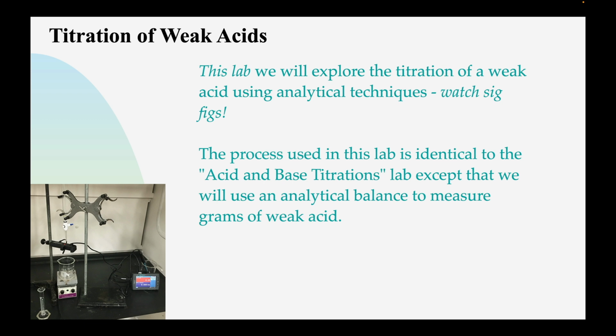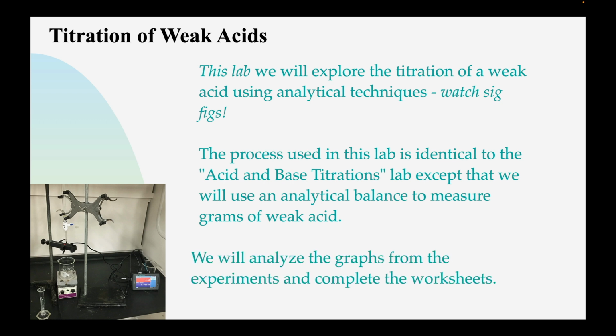The difference, once again, is that you'll use fancier balances and a little bit more stringent techniques to figure out the exact values for your weak acid. But overall, it's kind of fun. You can analyze the graphs from the experiments, complete the worksheets, and again, if you've done a good job on the last lab, this one hopefully won't take you too long either.